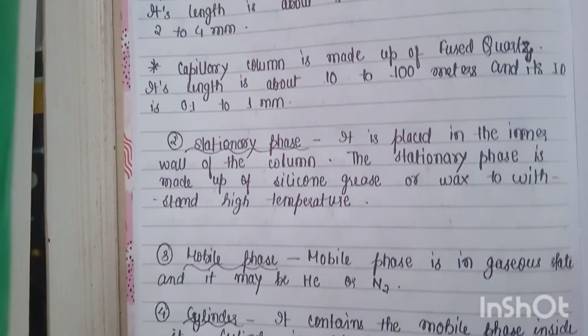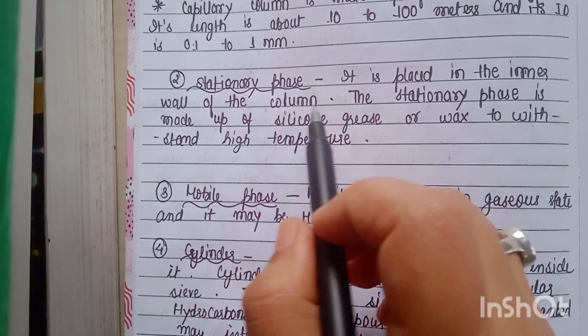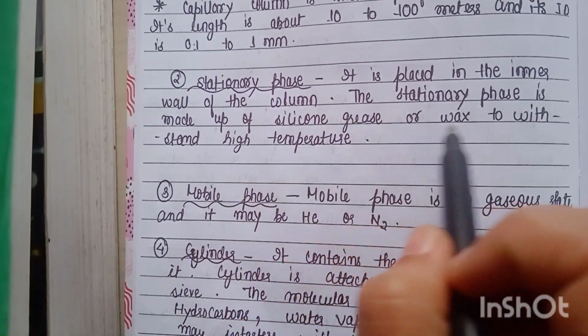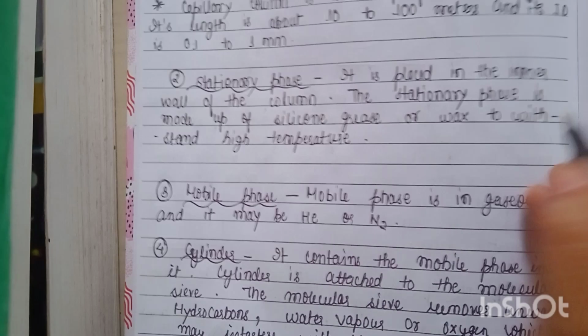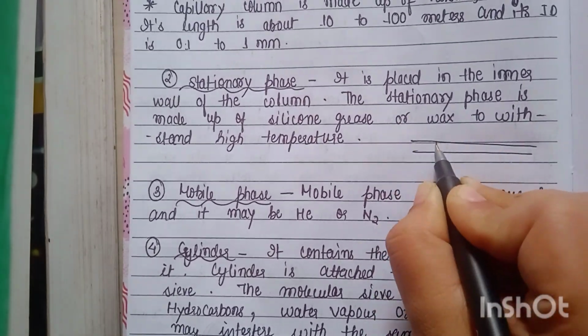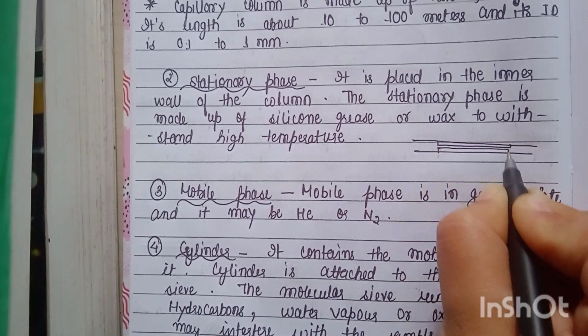The second component is the stationary phase. It is placed in the inner wall of the column. The stationary phase is made up of silicone grease or wax to withstand high temperature. This is the column, and in the inner wall of the column, the stationary phase is placed.